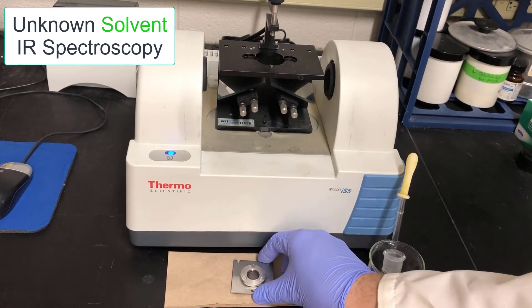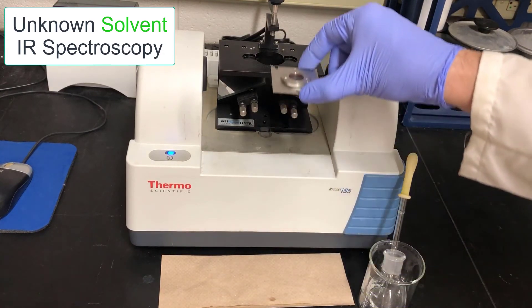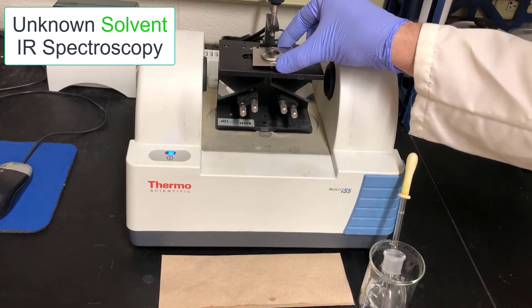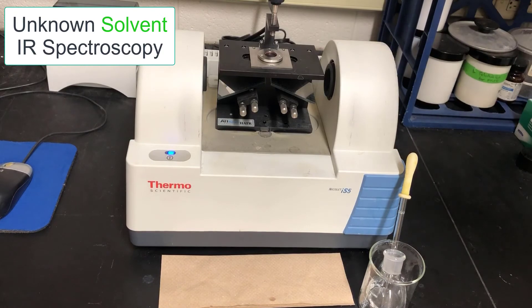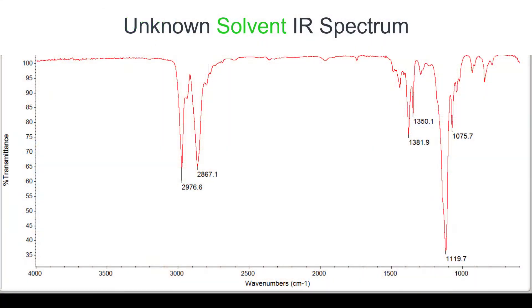So when you're doing IR spectroscopy on an unknown volatile solvent, fill up the well with solvent so that it stays around long enough to acquire eight IR scans on it. Here's a high resolution IR spectrum of the unknown solvent in the unknown in this example video. When you get to this point you should compare your unknown solvent spectrum to the reference IR spectra of the three solvents that were presented in a previous video.